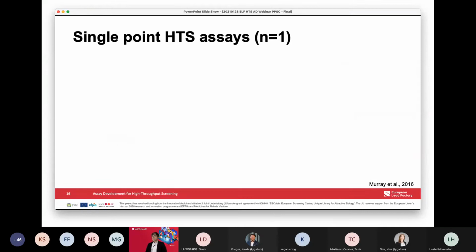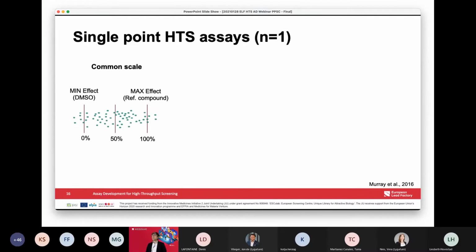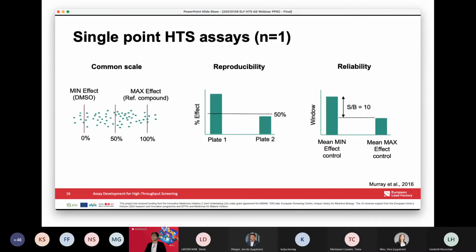So typically, in a primary UHTS campaign of large compound libraries, we are testing every compound once at a single concentration. This is typically 10 micromolar. It's vital that the assay is reliable enough such that this single test is a true representation of the activity of the compound. And we also need to be sure that each plate in the screen is valid and that data is comparable across plates and experimental runs.